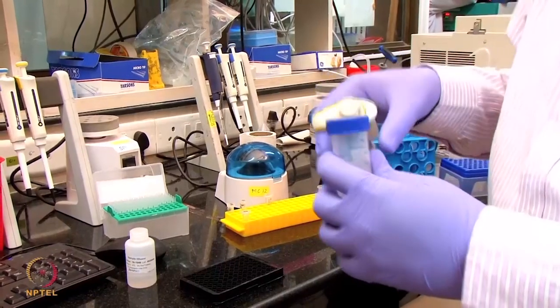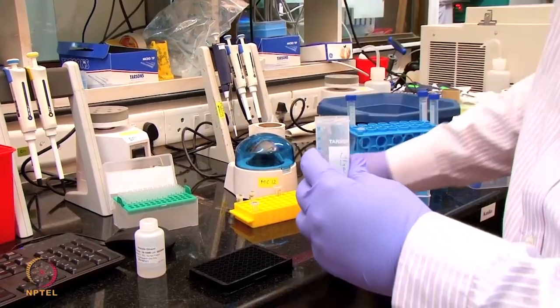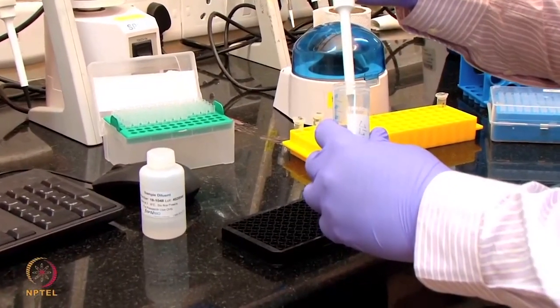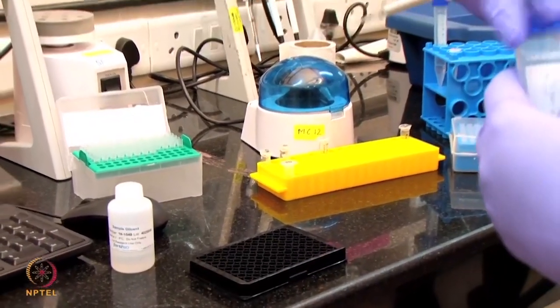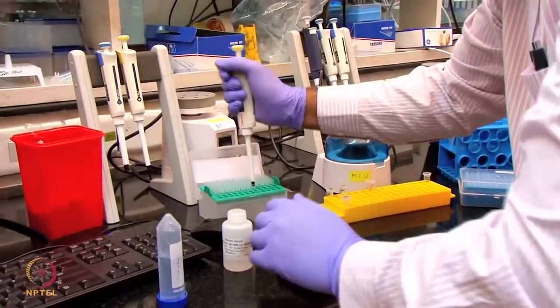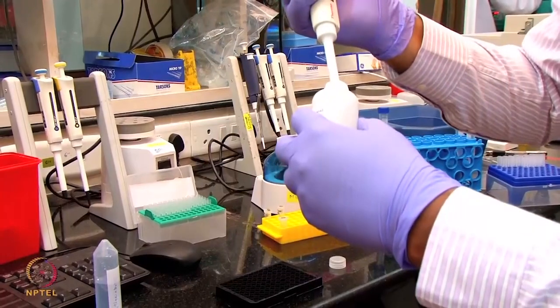So I'm using the glycine buffer, that is a pH 2, 10 millimolar glycine buffer. This is used for the regeneration of the sensor. So this regeneration buffer, I'm going to place at the A11 and the B11. So the bound apolipoprotein will be washed off when the sensor dips into this acidic buffer. Also we have to place one more, which we call a neutral buffer. That is this PBST buffer. I'm going to place this one at the A12 and the B12.